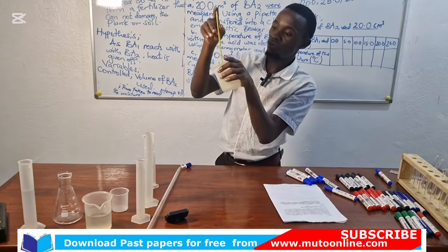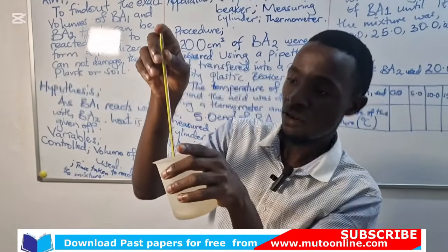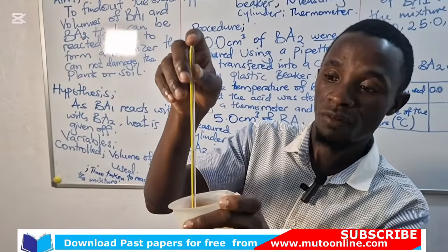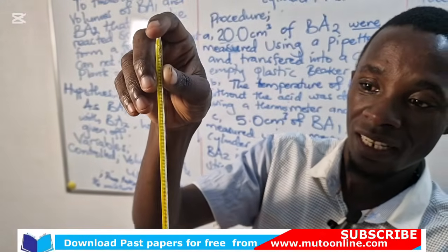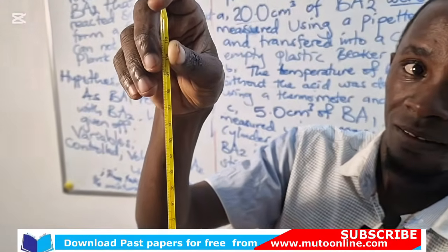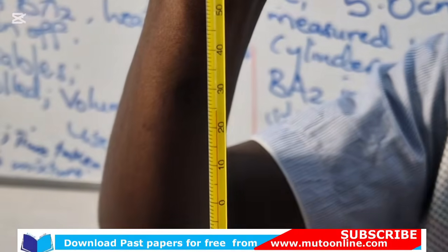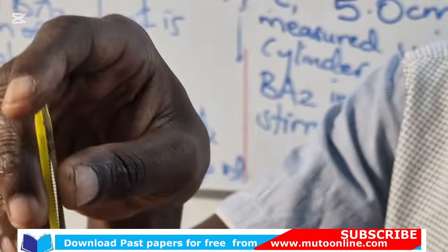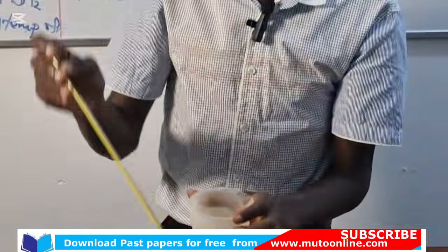And it is reading, it isn't moving anymore. It is reading 24, that red thread. It is reading 24 degrees Celsius.